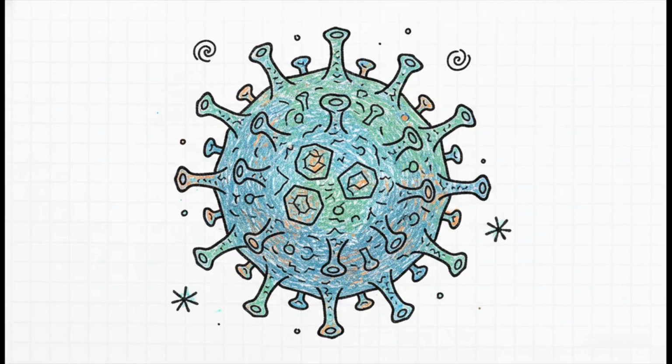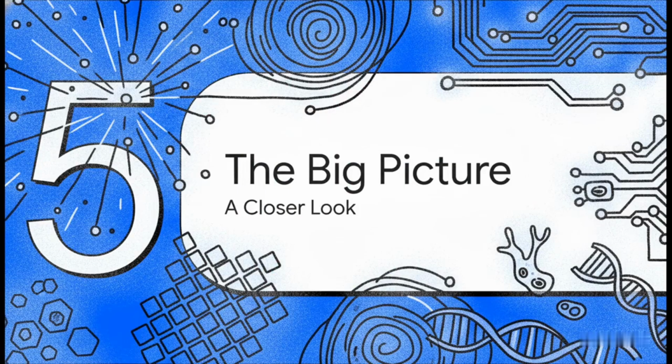I want to bring you back to this mind-bending statistic one more time. Approximately 1 nanometer resolution. When applied to biology, this means we can literally see the intricate armor of a virus or the complex folded surface of a cellular membrane with absolute undeniable clarity. We are intimately observing the very building blocks of life and the root causes of disease at a scale that was entirely unimaginable just a few decades ago. Let's move to Section 5 and see how this builds into our concluding summary.